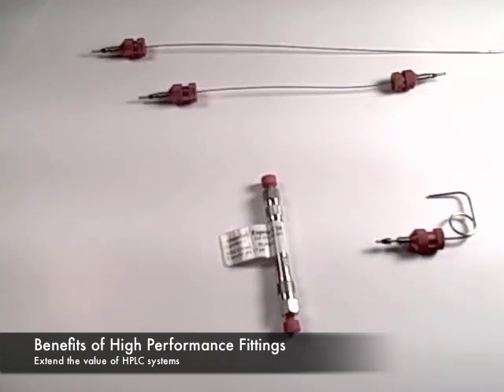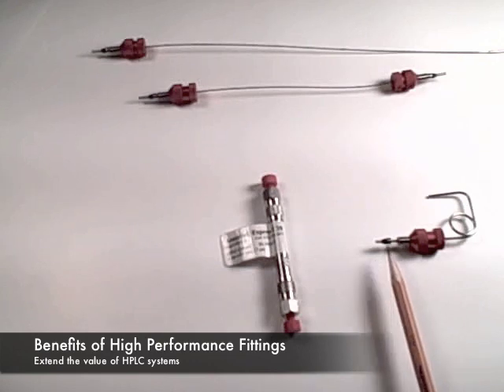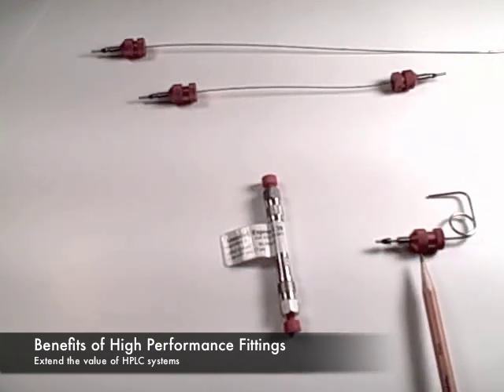The component parts of the fitting are the tip, the adjustable sliding ferrule design, the body grip, and the cap.